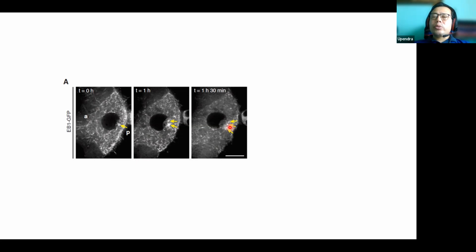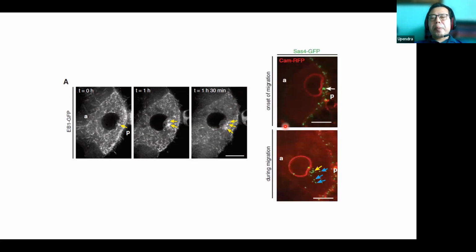Okay, and this was possible because of live imaging, and I can't show you the movie. It was a huge file and it didn't work, right? So people were able to show exactly, by looking at the live imaging, that it is actually pushing rather than pulling.